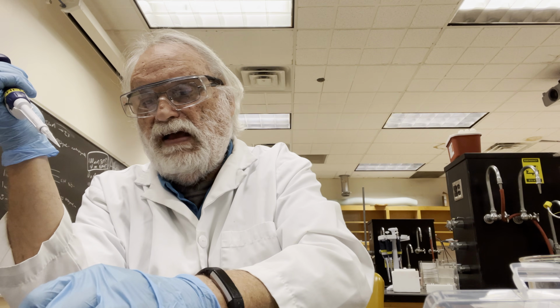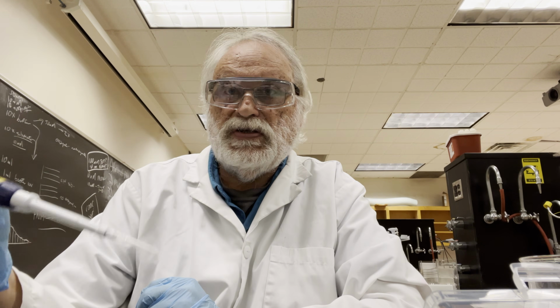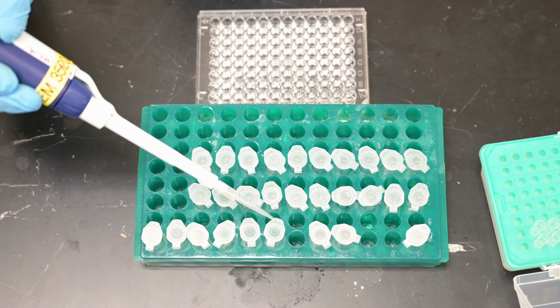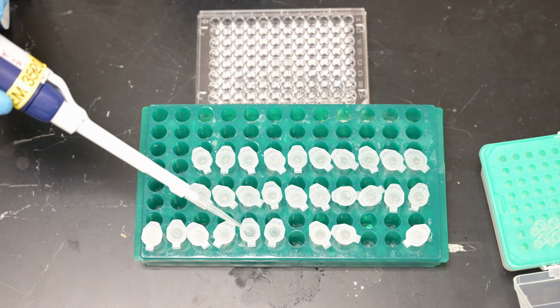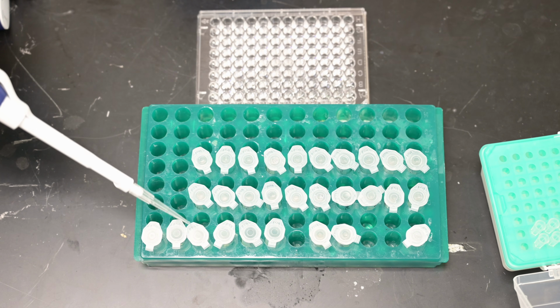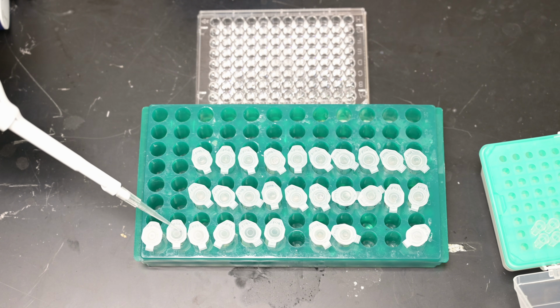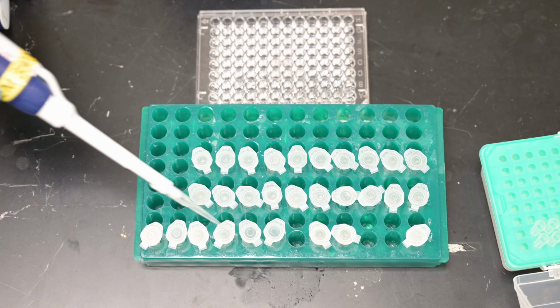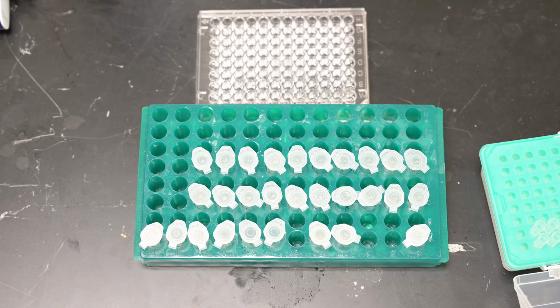So what I have now is a series of tubes. I have some 2 mg per mil sitting over here. And then I have 1 milligram per mil, 0.5, 0.25, 0.125, 0.0625, 0.03125 mgs per mil. So I have a series of dilutions here.